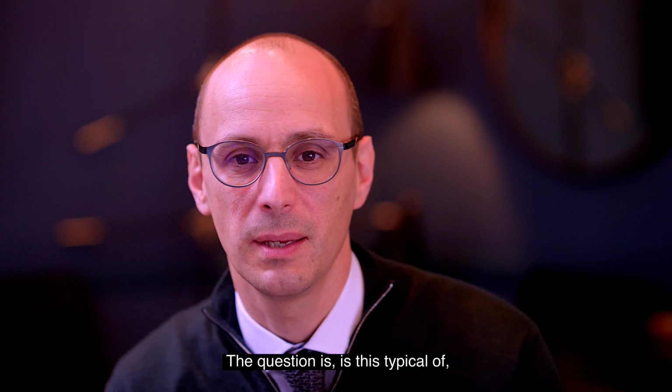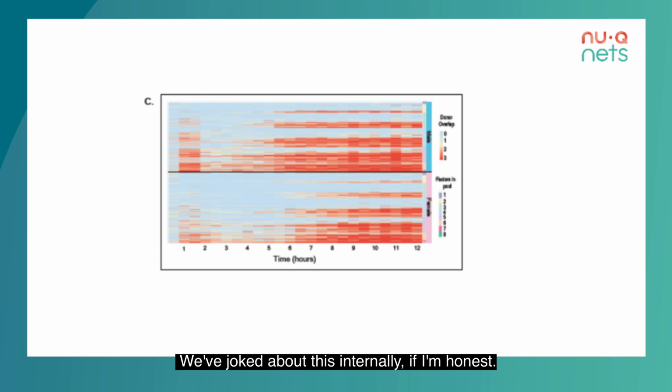So when we put all these factors together, we can actually see that there were different patterns of NET release from men and women. We've joked about this internally, if I'm honest: is there a difference between man flu and, is this a potential answer? I don't think so, but what it does show is that there are differences between men and ladies in terms of their NET release. It's possible as we scale this up that we might see this phenomenon more.